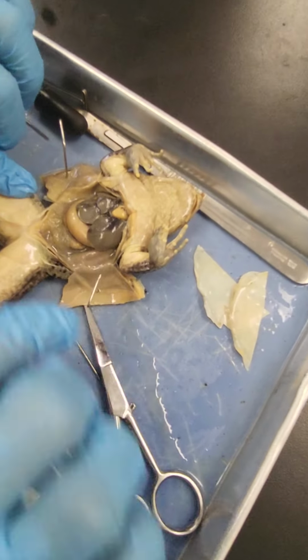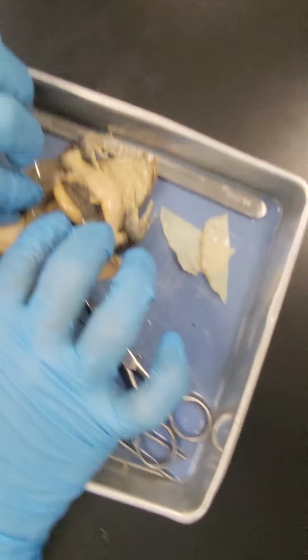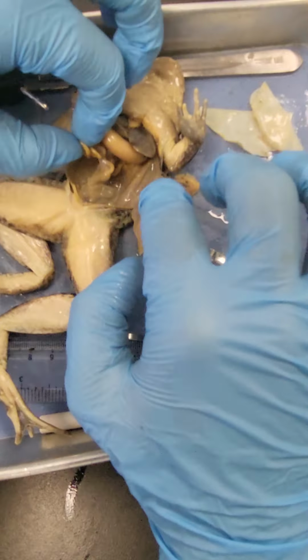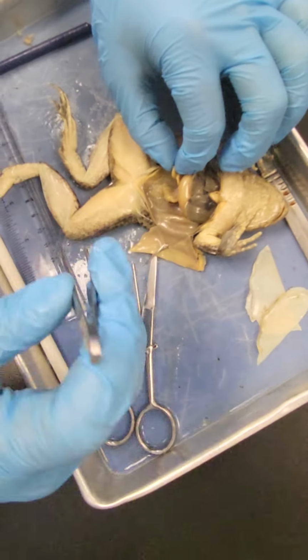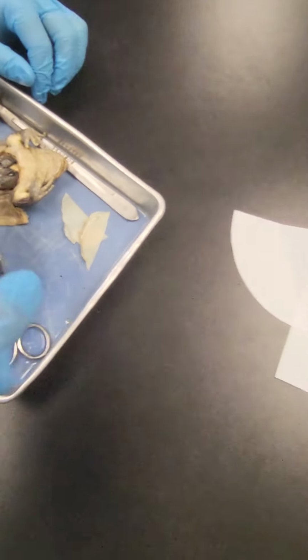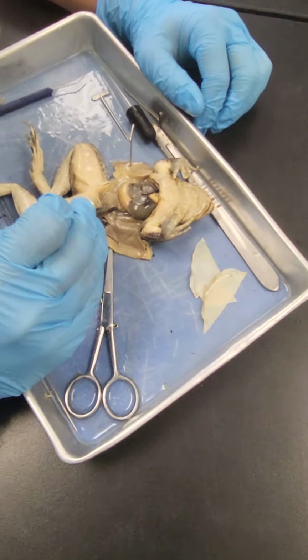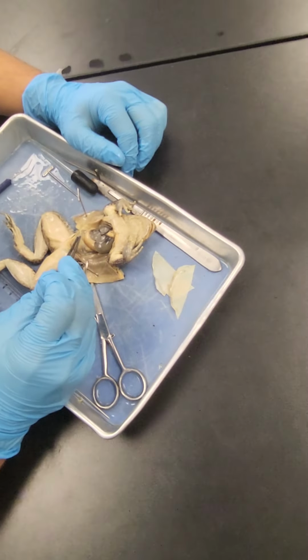They're side. Bright orange or yellow color. Yeah, it was on the left side on the video. Is this it? No, that's a part of the big organ. No, I think it means the heart. I think it means the frog is pregnant. I don't think it's pregnant. Wait, your frog's actually pregnant?